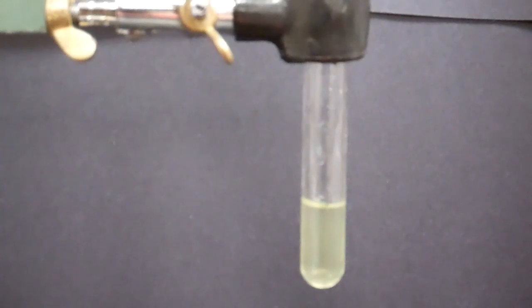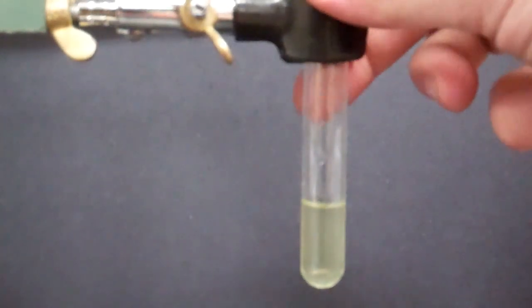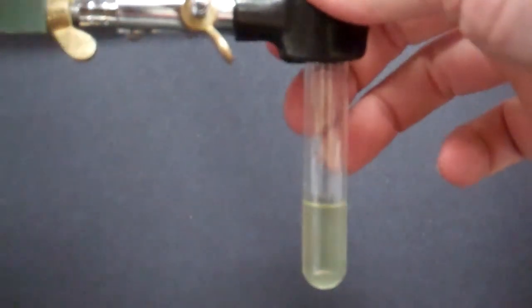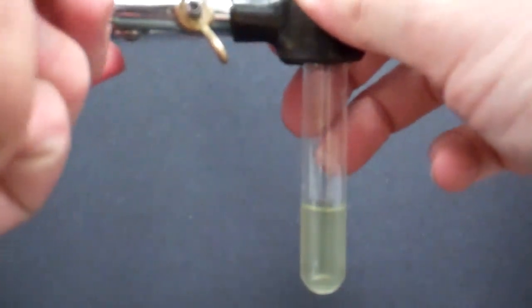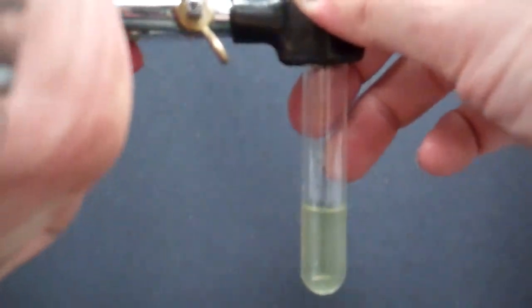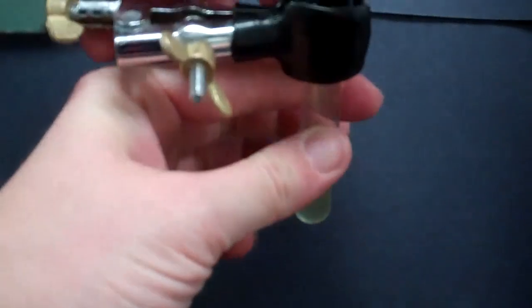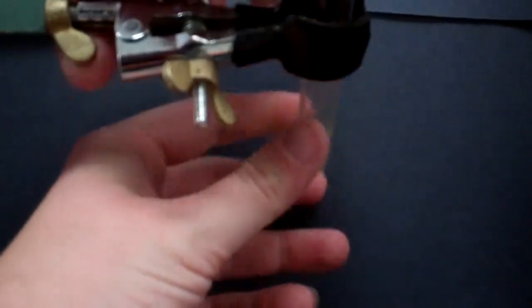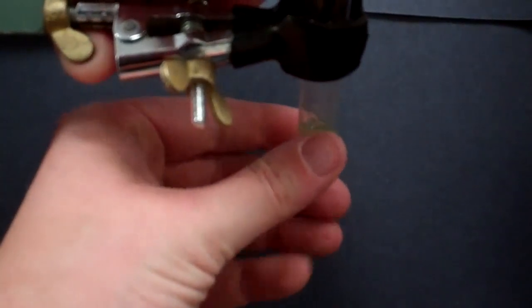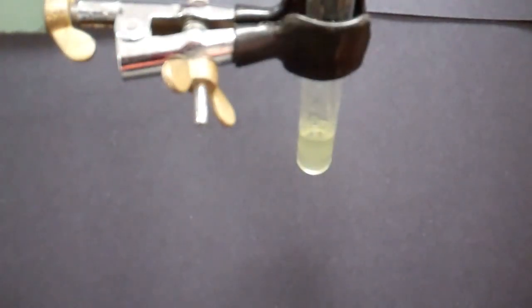This next part, we need to tilt the test tube on its side. When you are doing these anions tests, you want to be sure that you're using your test tube tongs to hold these test tubes. You should not be holding any of these test tubes with your bare hands.